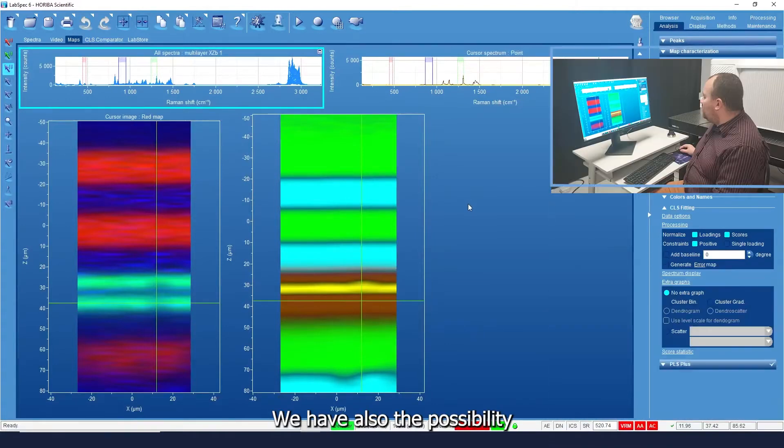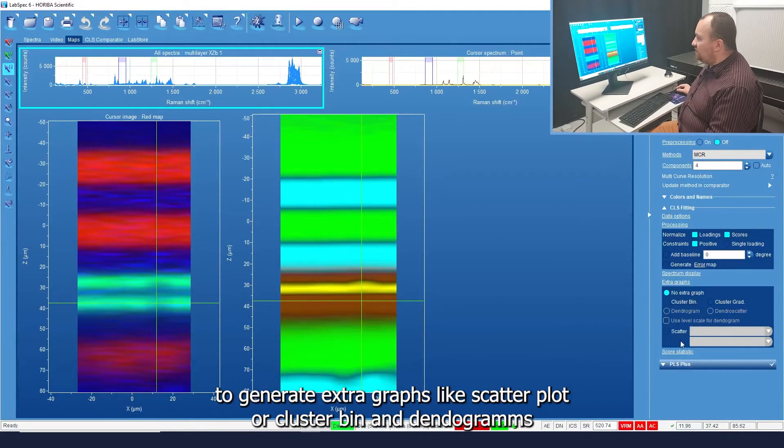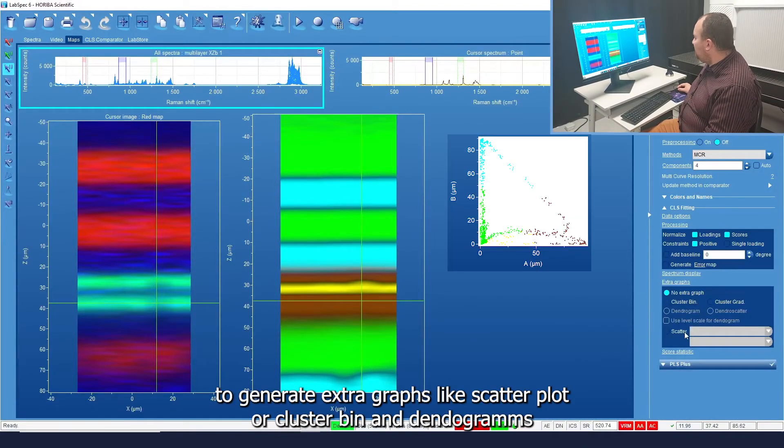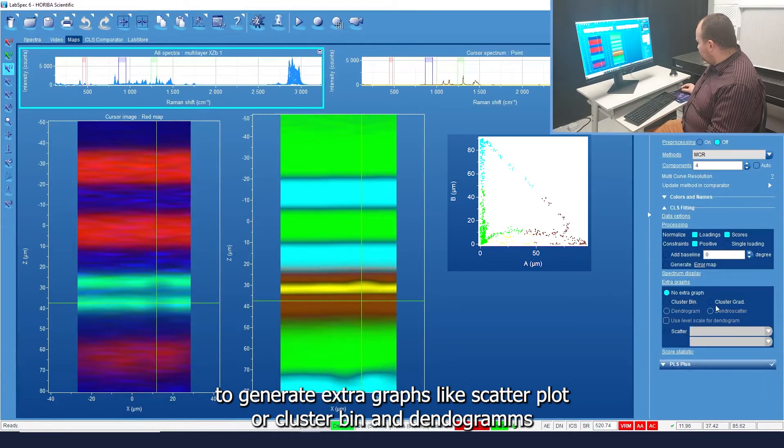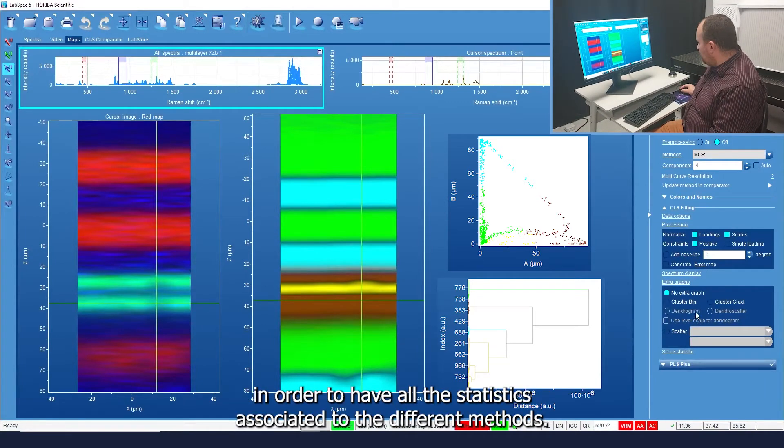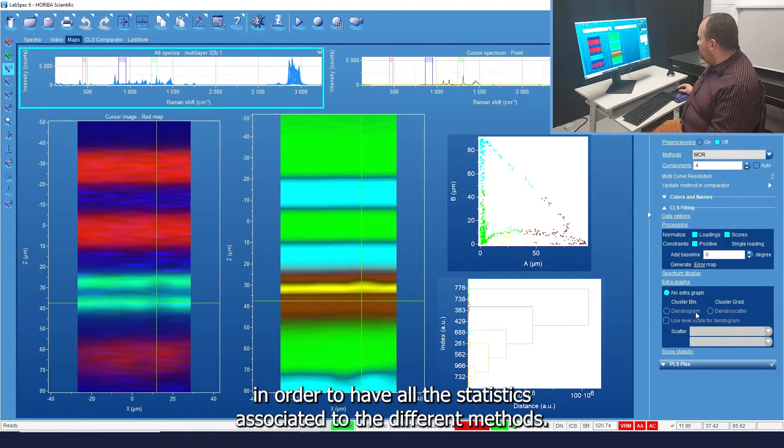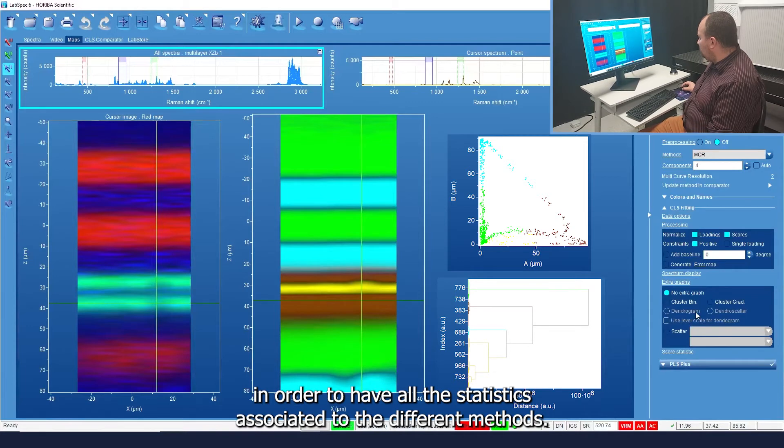We have also the possibility to generate extra graphs like scatter plots or cluster bins and dendrograms in order to have all the statistics associated to the different methods.